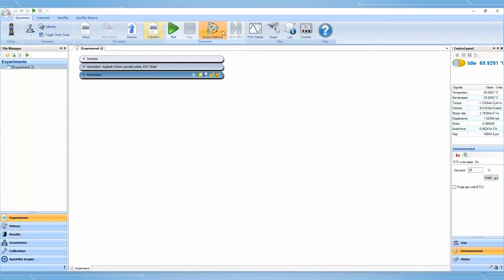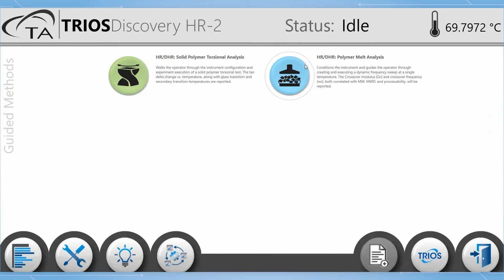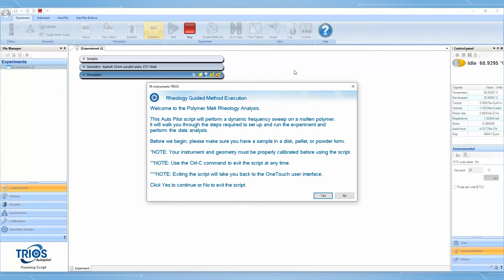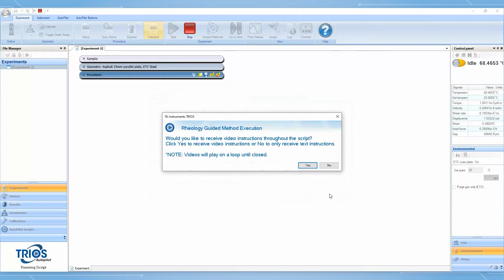In this Tech Tip, we will walk through the features of the DHR Polymer Melt Guided Method. With Guided Methods, Trios provides a simplified user interface and an instructional framework to reduce training time, mistakes, and user-to-user variability.